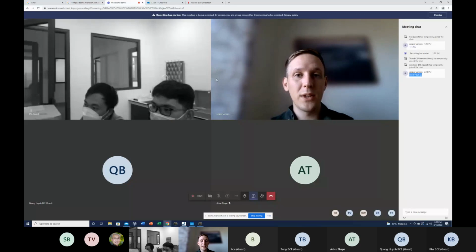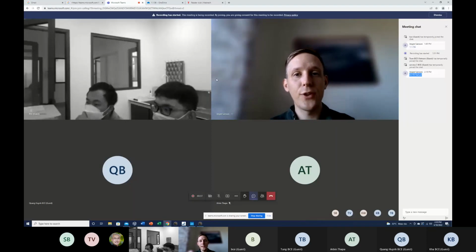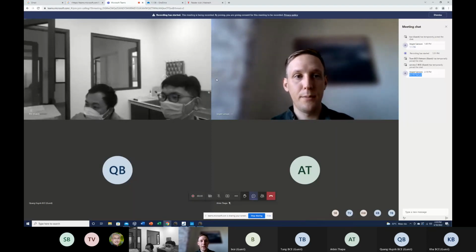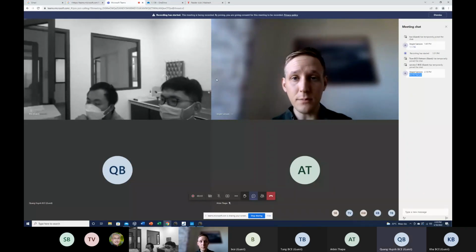But it's a little bit early to do the entire data analysis. So in the beginning we will have an overlap where we will help you with finalizing the IQOQ protocol, but long term we're going to have training sessions and make it possible for you to be 100% independent. Okay, thank you.